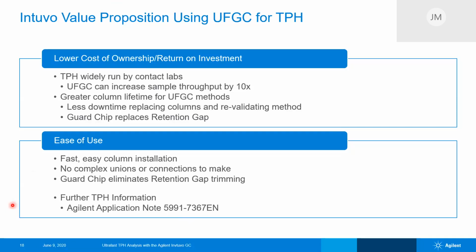For the higher boiling portions of the Texas method, this technique, or what I described here today, could probably be used. There may be some adjustment in the ramp rate that would have to be done to get good separation. But this is really geared towards the middle distillates, the C10 to C40 range. A separate method would have to be developed for other ranges.